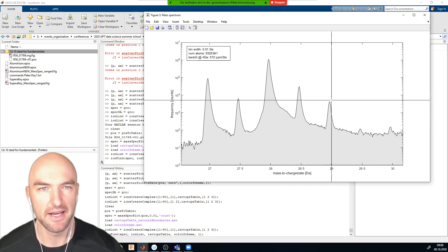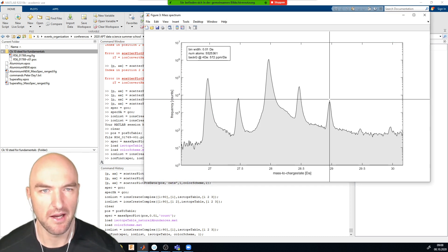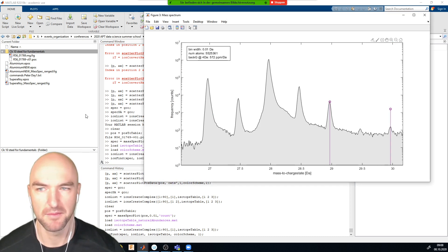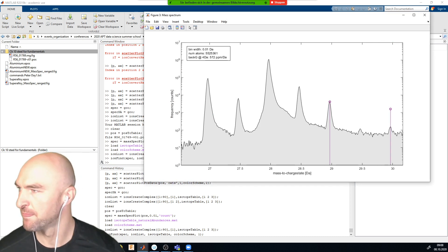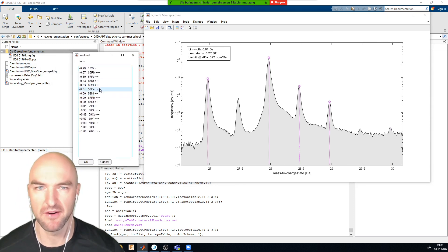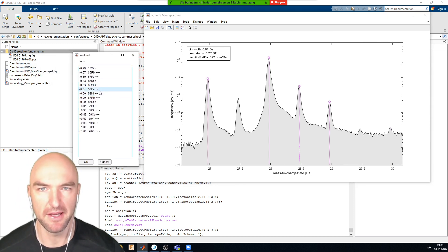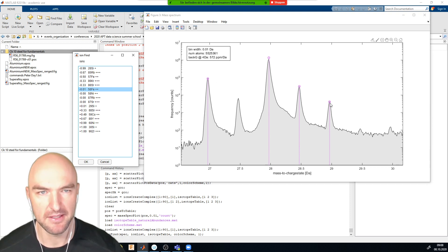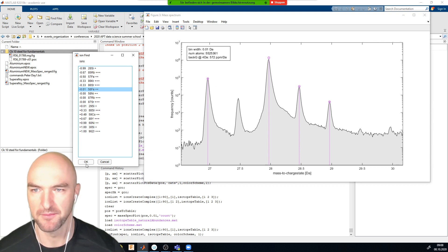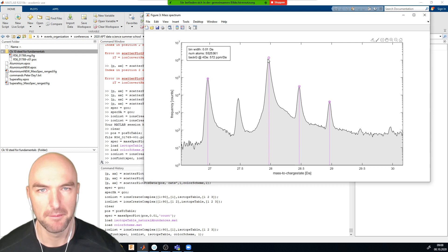If I look at the iron-58 peak, you can see the minor peaks are a pretty good fit. But the major peak shows a little bit of difference — there's a discrepancy there.